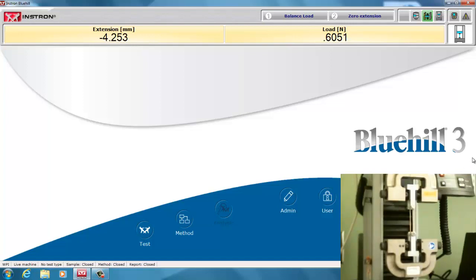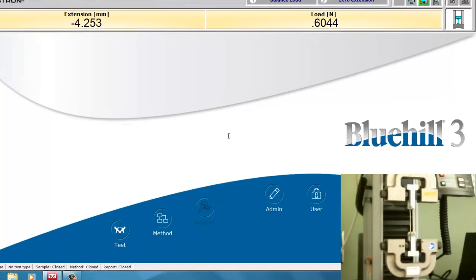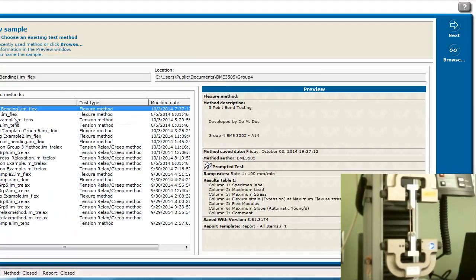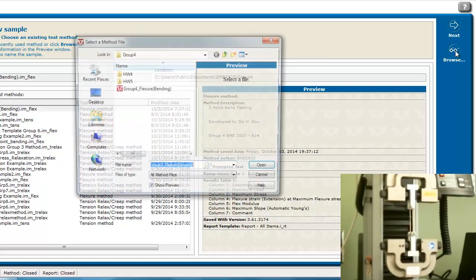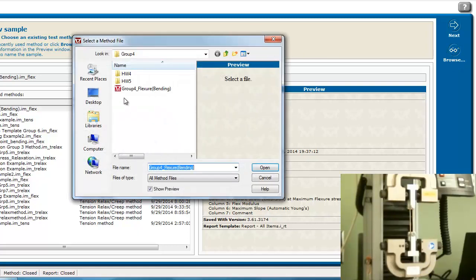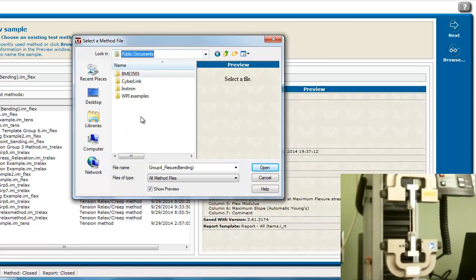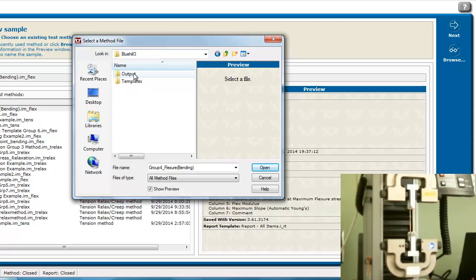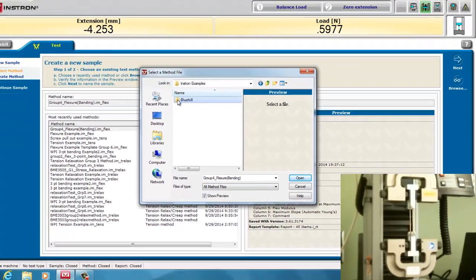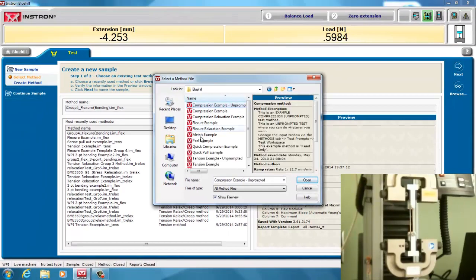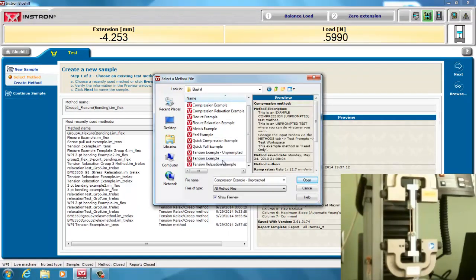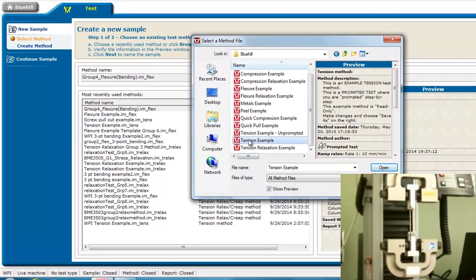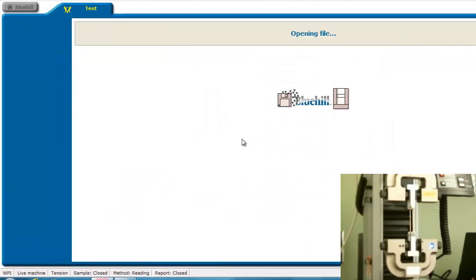As I said, we can use any tensile test for this. And so we can do any kind of tension example.